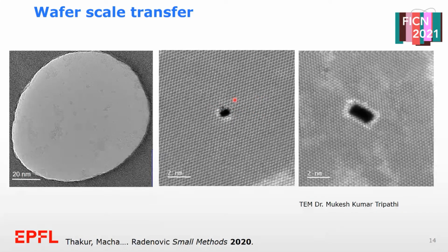So we are not yet at this stage. Our pores are still terminated stochastically based on how we make them. In the process of using the transmission electron microscope, we have some ability to shape them, but this is still not at the level of the reproducibility that is achieved by nature.